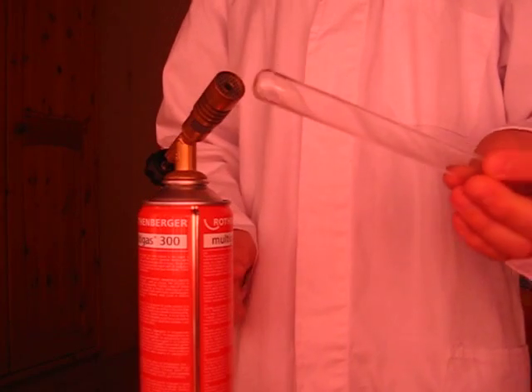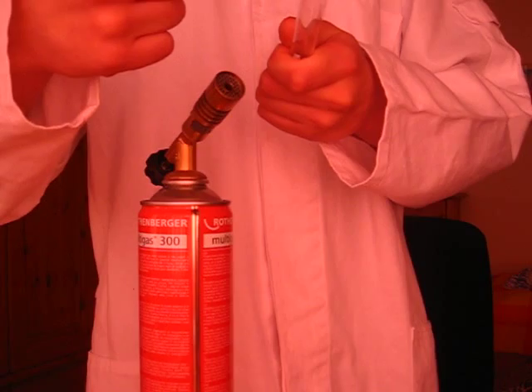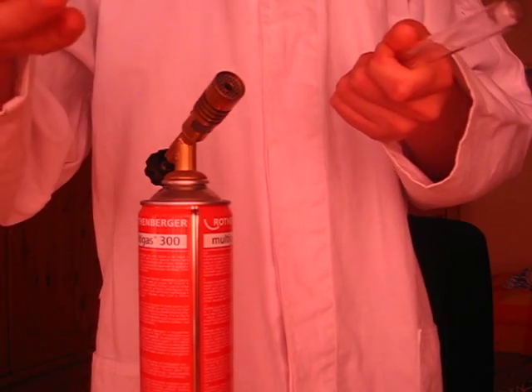As you see, the test tube is clean, and this is because the black particles are carbon, and we burned that off.